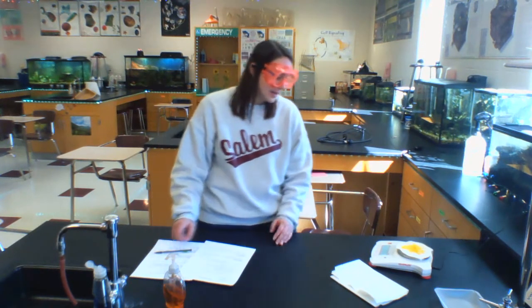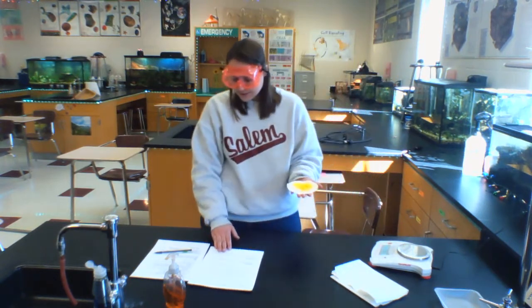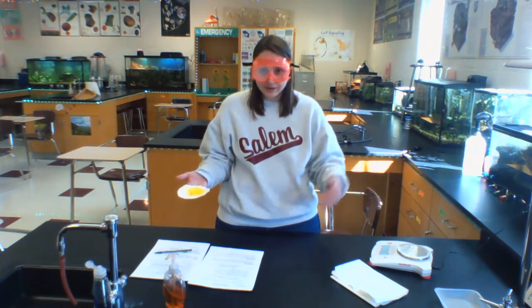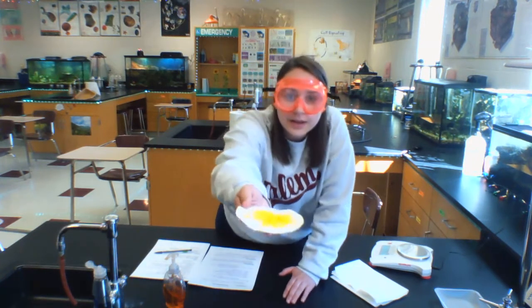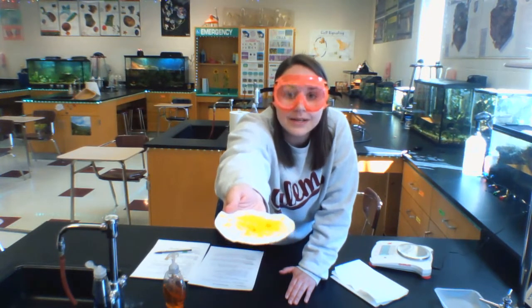And by the way, just in case you are curious, this is a really nice looking product. This is lead iodide, which came from the potassium iodide reacting with the lead nitrate, forming lead iodide and then potassium nitrate, which was liquid in the solution. But this is our lead iodide, and it is yellow. It's a bit shimmery. It's a pretty nice product. But at this point, it's all dried.